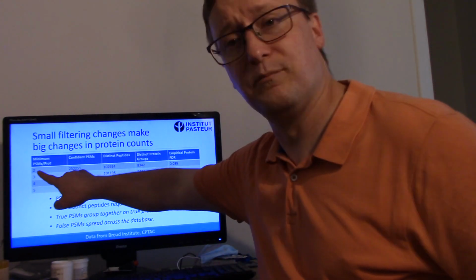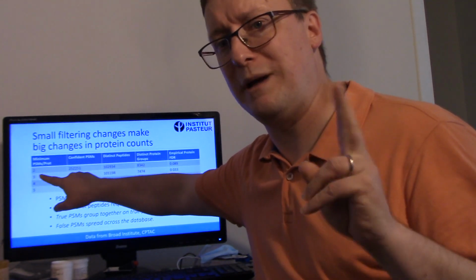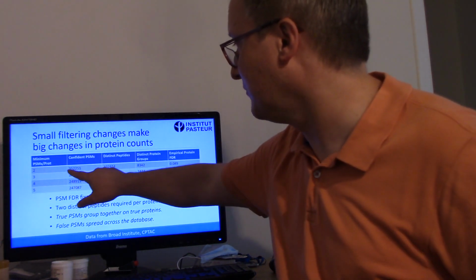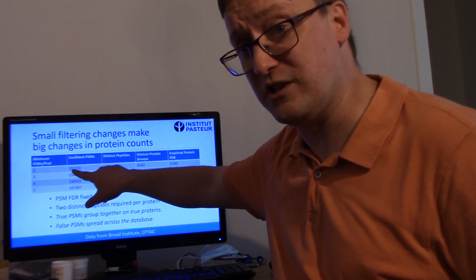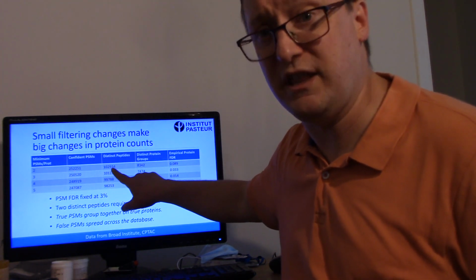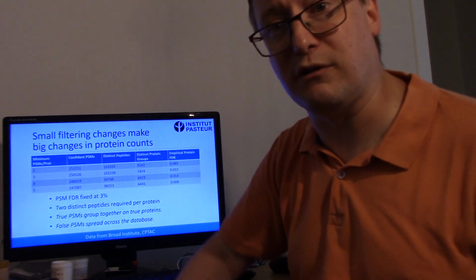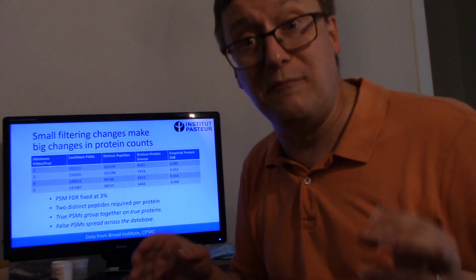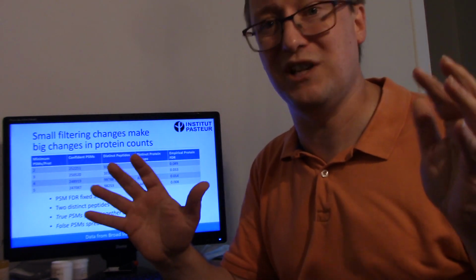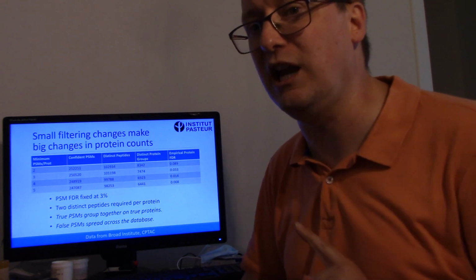Let's start at the worst case. If I start with just a 2-peptide rule, in other words, I'm saying only 2 peptide spectrum matches need to be present for a protein for me to claim it's been identified, I have 252,000 confident peptide spectrum matches. They match to about 103,000 different peptide sequences, and there are 8,342 protein groups. So at that, my biological collaborator is really excited. Wow, I get this huge number of proteins with this experiment. I'm fantastically happy. But something is lurking in the data.